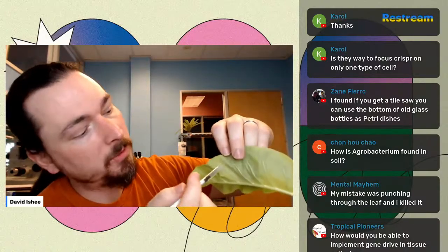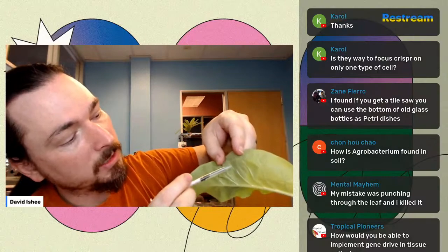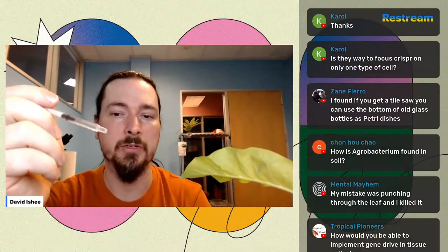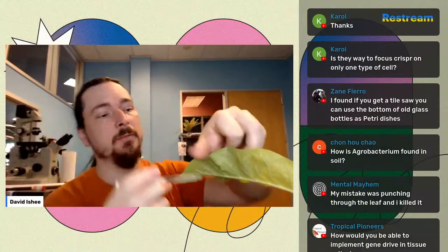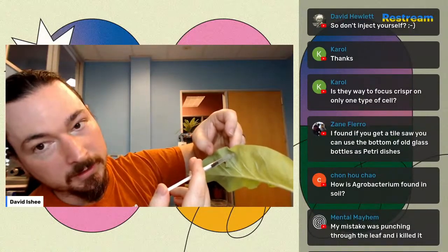When you're pushing down on it, you want to get between these little vein structures. So you'll see there's a ridge. And obviously if you're trying to push something flat and it's half on a ridge, then it's just going to leak out. You're going to have to use tons of pressure to basically just crush it flat. So if you start with a flat space, you can use very light pressure. So you start with a really light, nice and flat spot, and you just press, and you'll see it starts leaking.